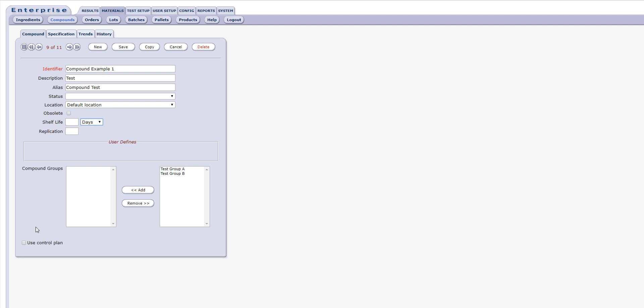Note that the compound may be assigned to a compound group only if the applicable group has already been created. You could elect to create the compound group after the compound has been created and return later to the compound editor for assignment.